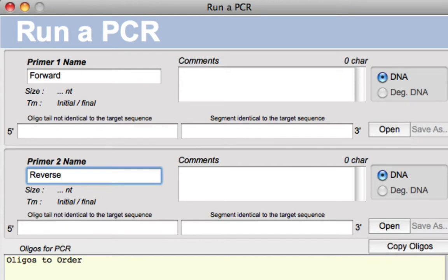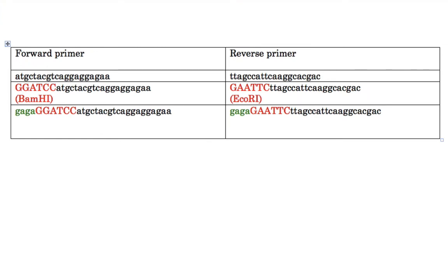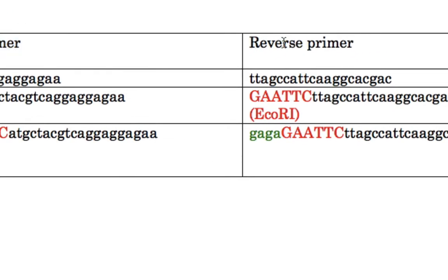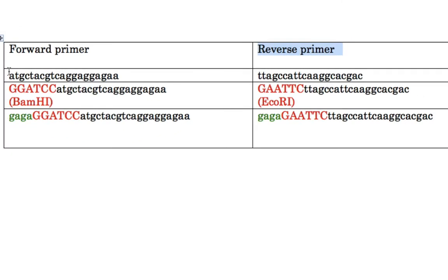So let's imagine that we have already designed our primer. I have designed it from Primer3Plus website for cloning. So this is our forward primer. This is reverse primer details. It's a sequence of our forward primer which is identical to the target sequence, that is BBK56 gene. That is why it starts with ATG, right? The start codon. This is the reverse primer.